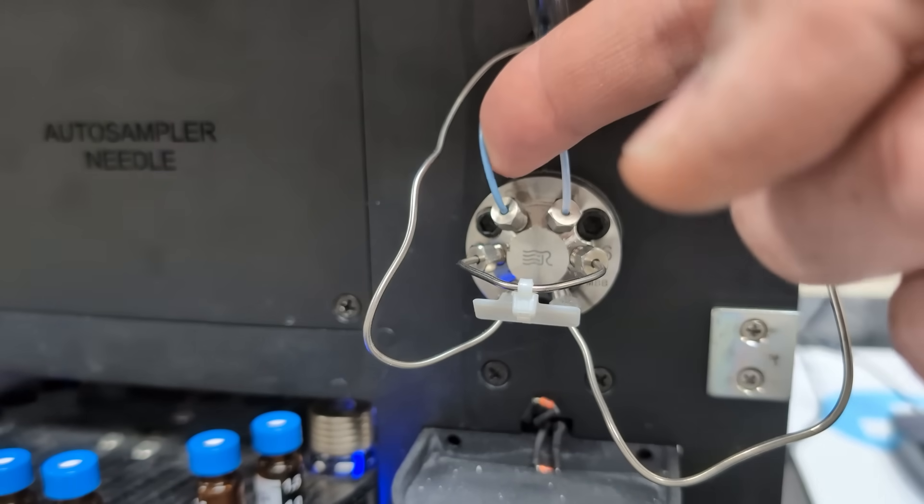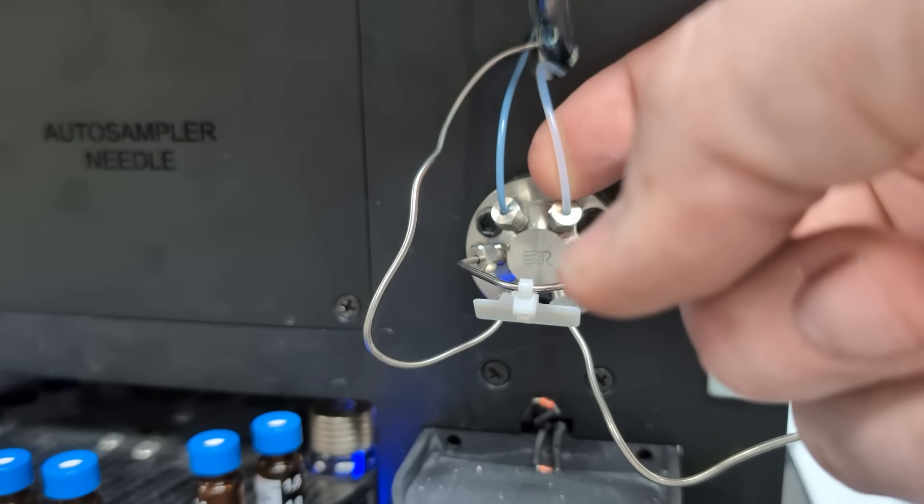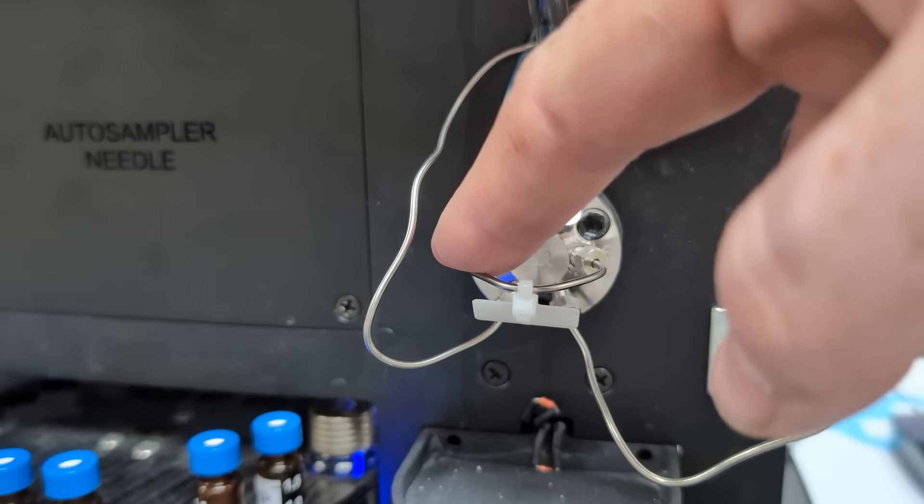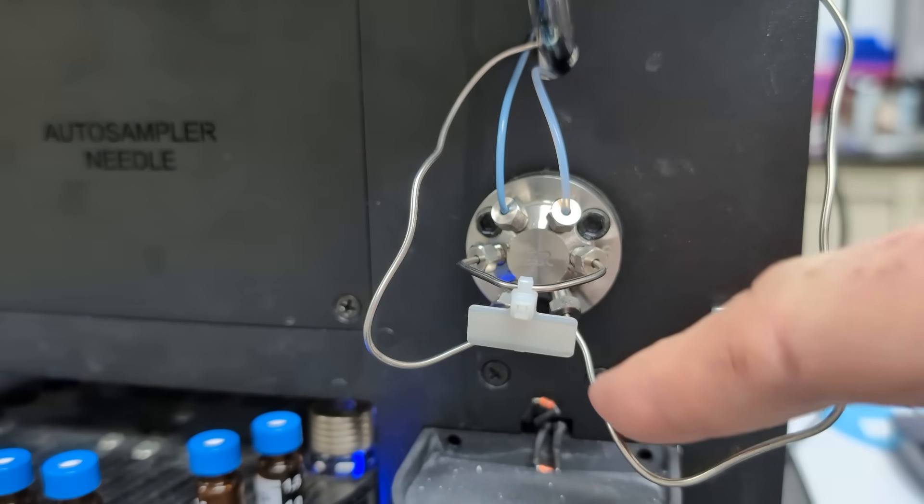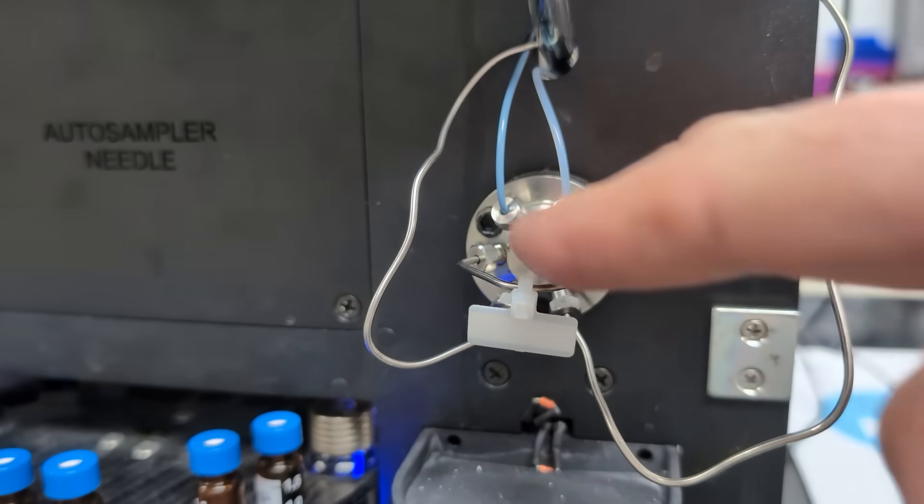Then the pump connects to our sample loop, comes through our sample loop and down here, and up into our column oven, through our column, and into our detector.